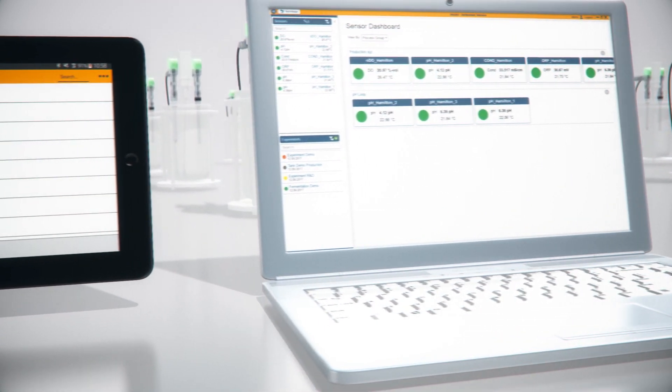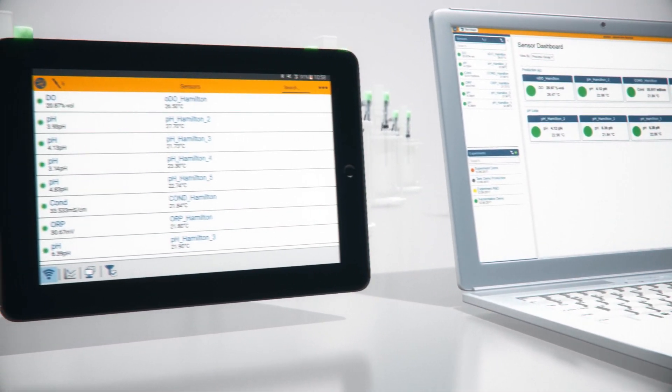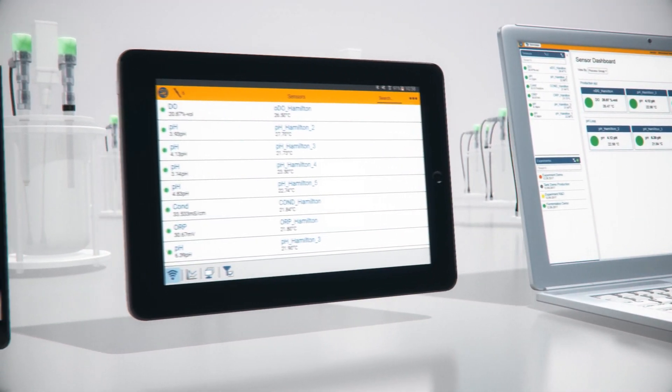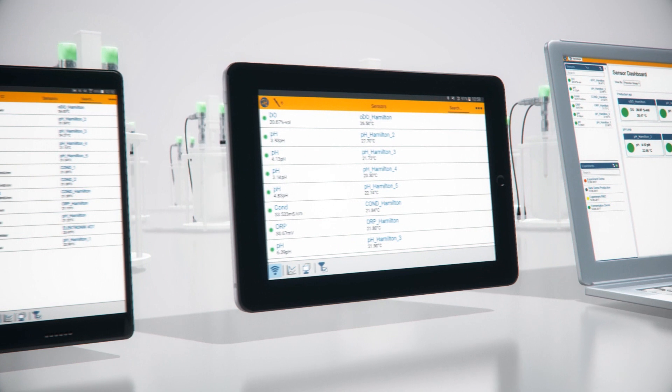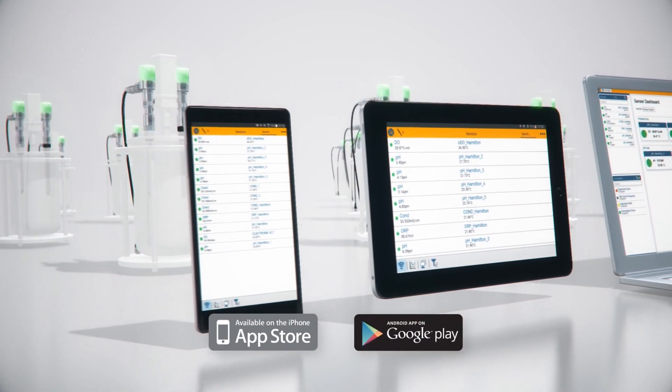In this guided tour, you will learn how to use the ArcAir software to configure, calibrate, and validate your sensors.